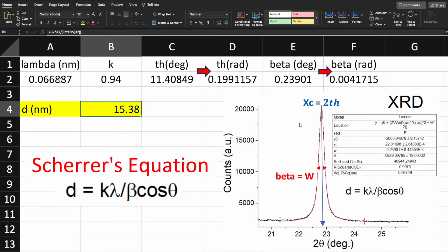Theta is half of the 2 theta value, which is 22 degrees over here, and is in degrees.